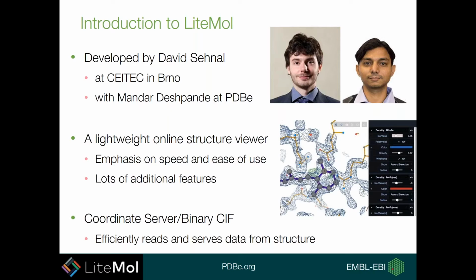Something else that David has worked on is the coordinate server. This is an added extra onto Litemol, and it is improving the speed even further by only serving you data that you need and speeding things up even further.